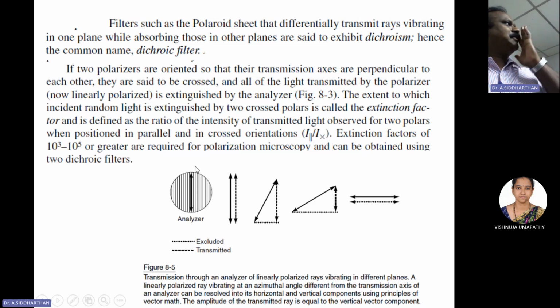Okay, so if I have another crystal, or if I modify the orientation of the analyzer with respect to this orientation, I rotate it now. Somewhere it becomes nullified. Where does it become nullified? This location. So here it is maximum. These are intermediate. This is 0.